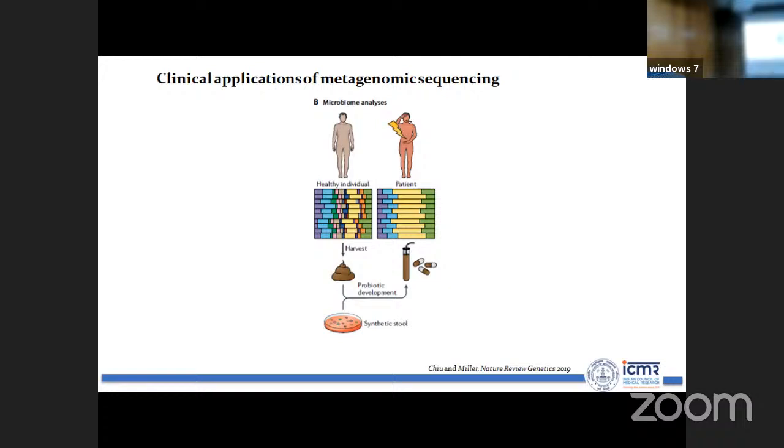No. Actually, it is talking about different genera, different species. Yeah, those are samples. Columns are basically different organisms. So this is from a paper, collected from Nature Reviews Genetics. You can just follow this. This is quite a useful application in the clinic actually.